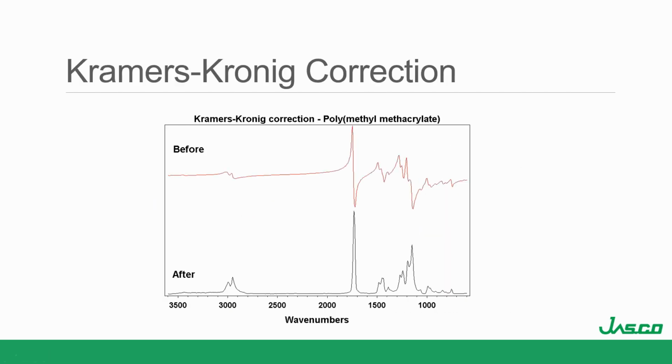One drawback is that sometimes, if the refractive index is at a certain value, it will cause these derivative peaks. This is actually the real part of the spectrum and the imaginary part of the spectrum according to Snell's law. This can be corrected through the computer, through the software, and you can get a regular spectrum.